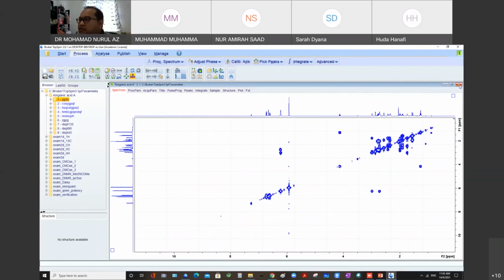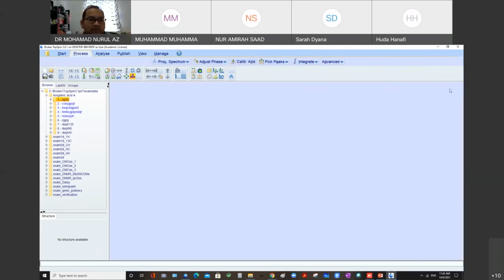Okay, COSY is finished. Anybody who has a question can put it inside the chat box. Where is it? Okay, next we have to go to HSQC.